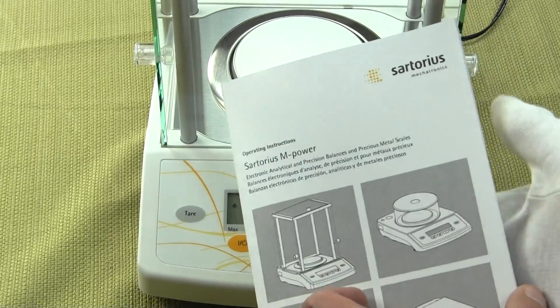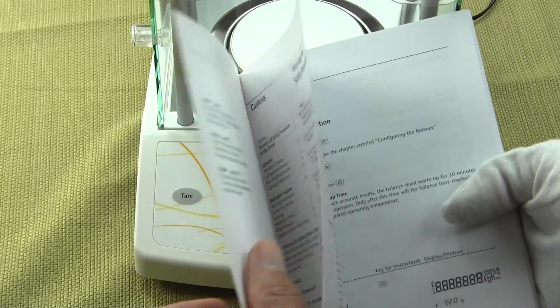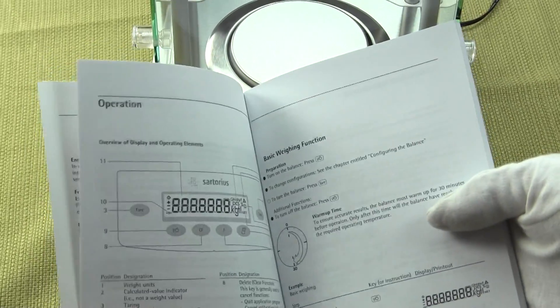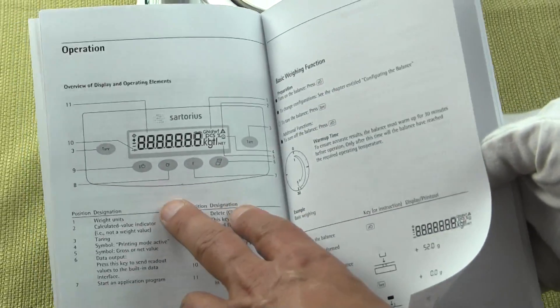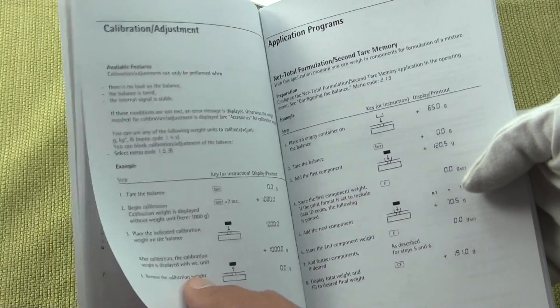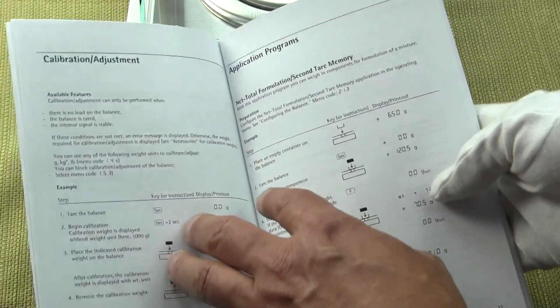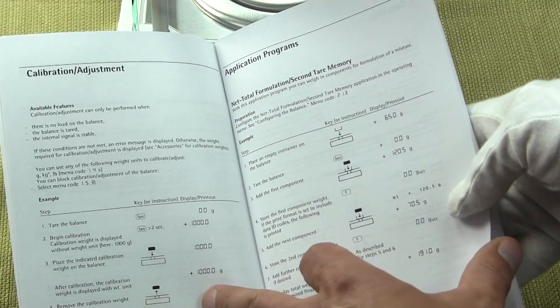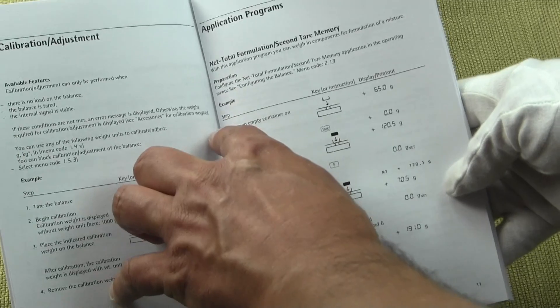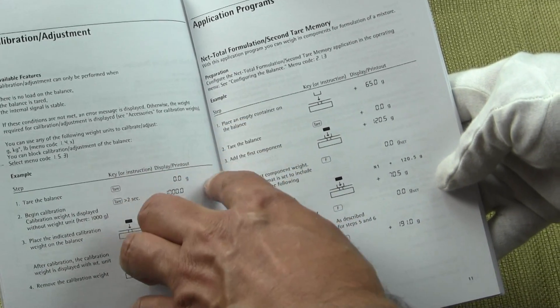The manual, very simple, step-by-step instructions, very well detailed. Again, Sartorius does a great job explaining all the key functions. And if you wanted to get into application modes and how to set it up, this is net formulation. You can see Sartorius gives you step one, two, three.